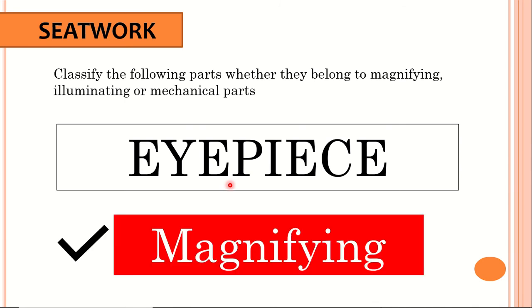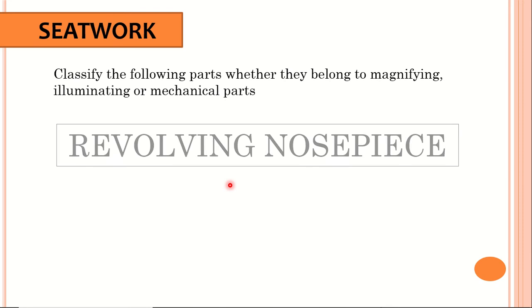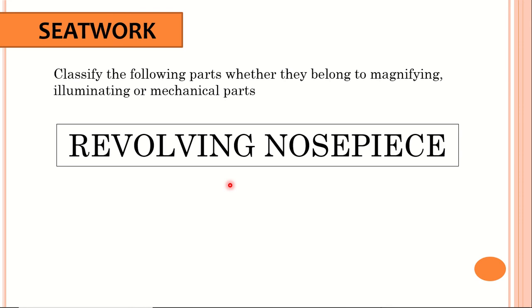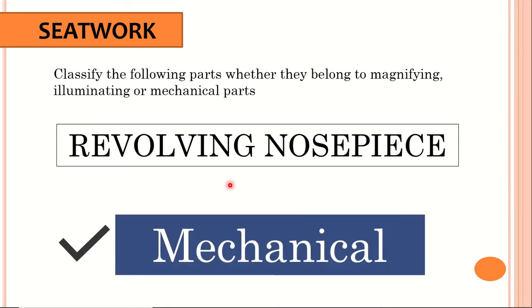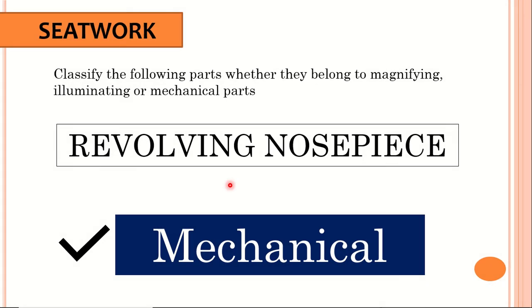The answer is magnifying. And now we're down to the last part, revolving nosepiece. What is your answer? Very good. The correct answer is mechanical. Good job. You answered the simple seat work correctly.